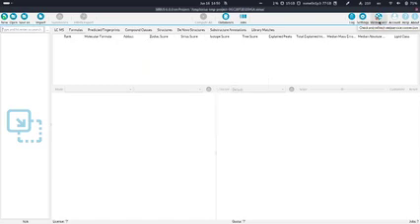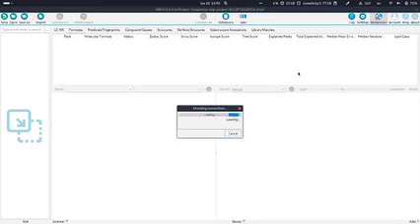But what is very important and what we all have to do now is, if we click on this web service button, there's a small red X if you are not logged in or if something is wrong with your connection. I hope everything works now with the conference Wi-Fi. It's already taking a little long.